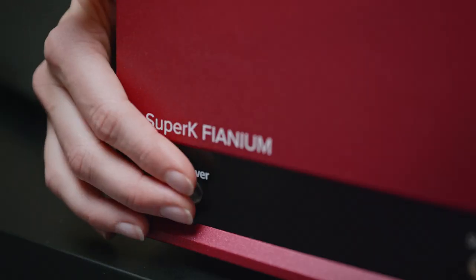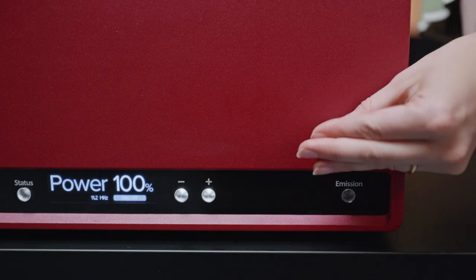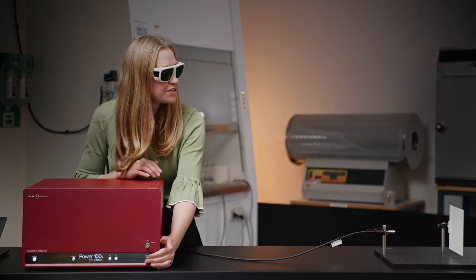First, I turn the laser on, then I arm it, and then I can turn on the emission.